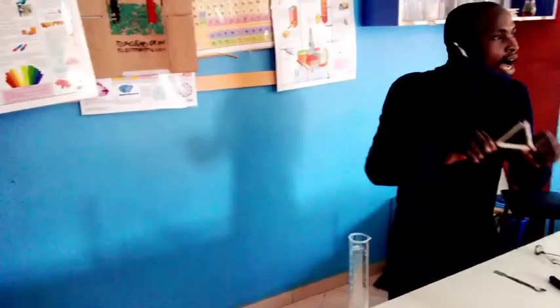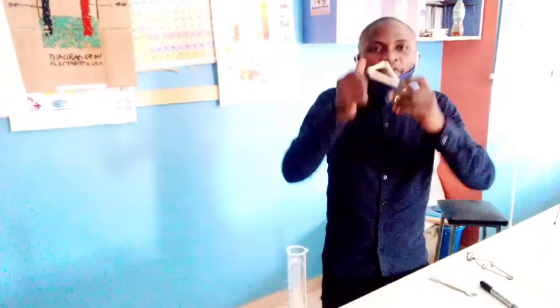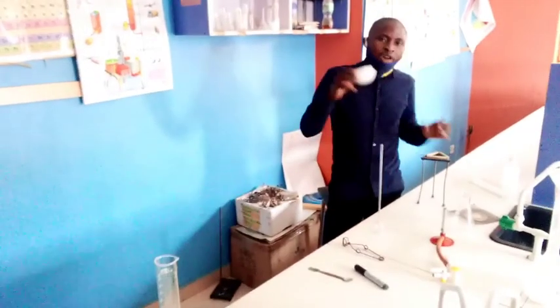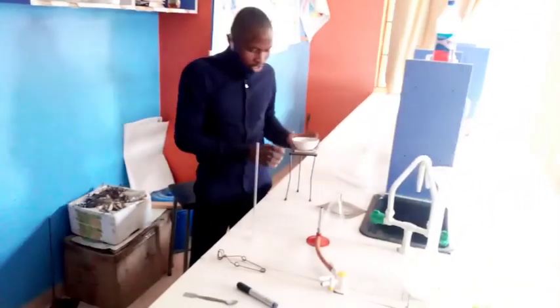Then we have what I call FCT. Of course, it's not Federal Capital Territory. It's called Fire Clay Triangle, FCT. Or you call it TPC, Triangular Pipe Clay. It is used for supporting the crucible on a tripod stand. This is a tripod stand. Of course, we don't want a direct supply of heat to the tripod stand. So this is used to support the crucible on a tripod stand. So this is called FCT, fire clay triangle, or also triangular pipe clay, TPC, not PTC.